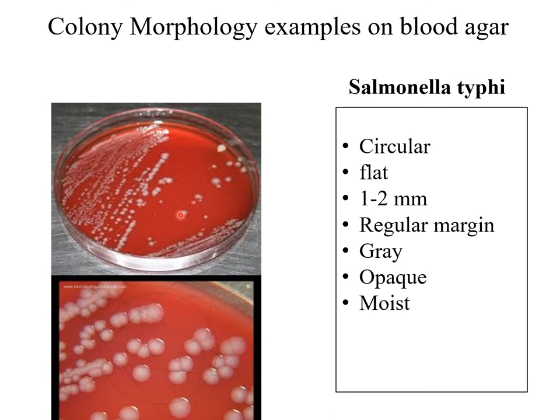Here we have Salmonella typhi. The colonies are circular and flat, 1 to 2 mm in diameter, with regular margins. They are grayish in color, opaque, and moist.